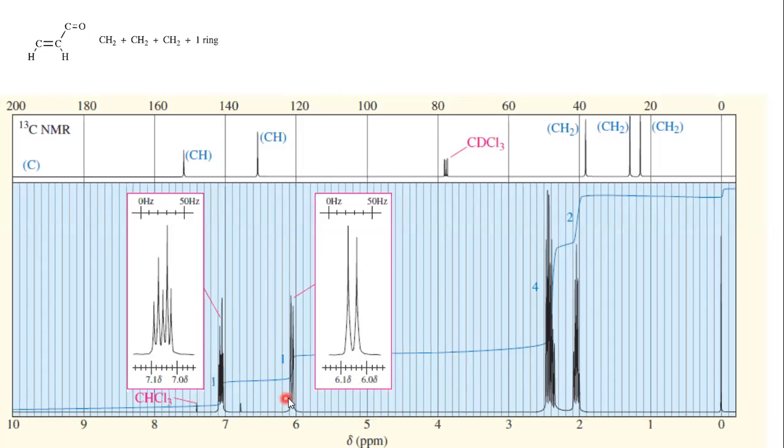And here we also have a CH and a CH, and these are in the form of a doublet, and this doublet is then further divided into other peaks. It is a doublet because of a nearby CH, but then that doublet is split up into a multiplet because that is attached to another group, that is CH2.